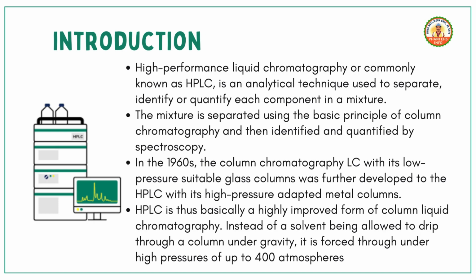HPLC is incredibly useful. In the pharmaceutical industry, it ensures that medicines are pure and have the correct amount of active ingredients. Environmental scientists use it to find pollutants in water and soil. In the food industry, it checks for additives and ensures products are safe to eat.